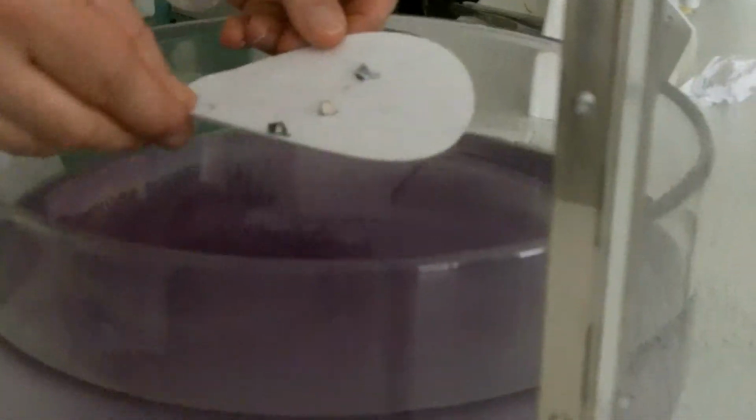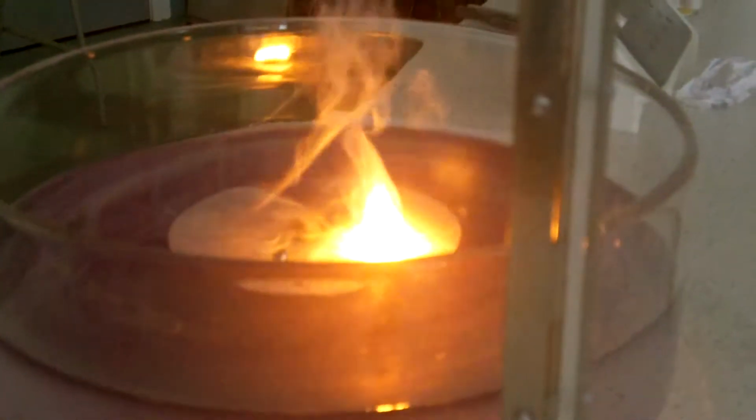Okay, so here we go. Here, guys, lithium, sodium, potassium in order. All right, here we go. I'm going to put that into the water just like that, just to show how reactive they are. Wow. So notice the flame of the sodium. That's the sodium in the center. Notice the flame color. Very bright orange, isn't it? It's very unpredictable, and I actually do sometimes get a little bit nervous when I do that. And the lithium just sort of sits there and fizzles away happily.